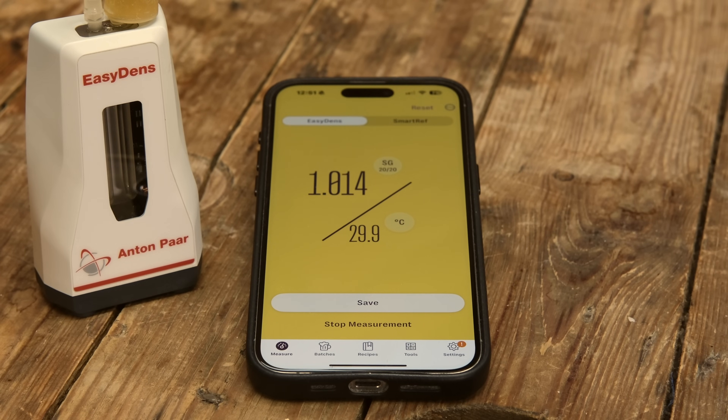Especially if you're somebody that likes to take readings all the way through and log those readings, because you can log those in the app against the batch you're brewing and see exactly where your beer is during fermentation. You can record this in the app to keep a log of everything. You could also share this with other people — if you're in a homebrew group you can all use the same device, as the app doesn't lock down to one individual person. All you have to do is download the free app on the app store and link up to the device, and you can save your own results on there. The display is really nice and clear — a big presentation of both the gravity and the temperature of the sample, which is a handy extra. You get your sample results in literally seconds.